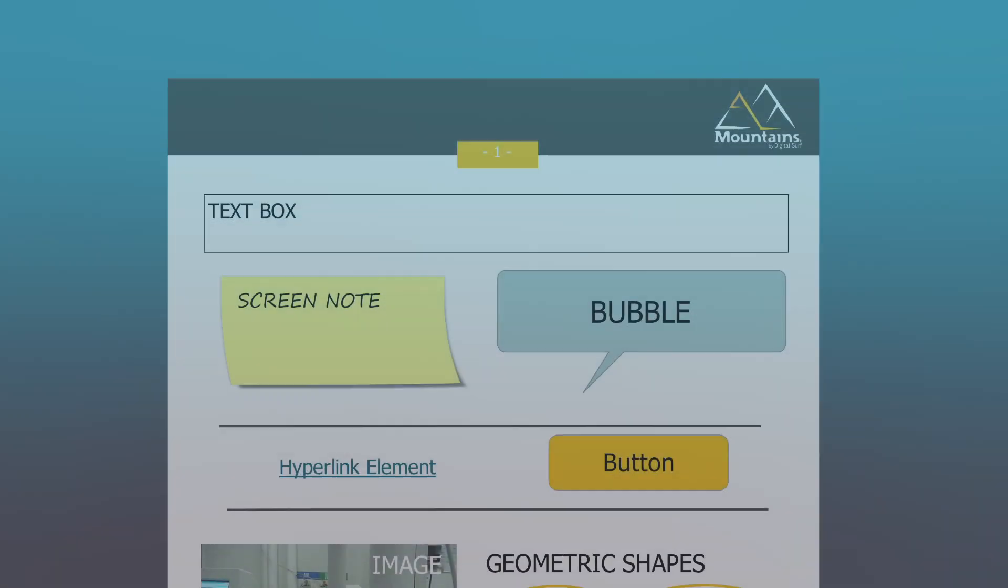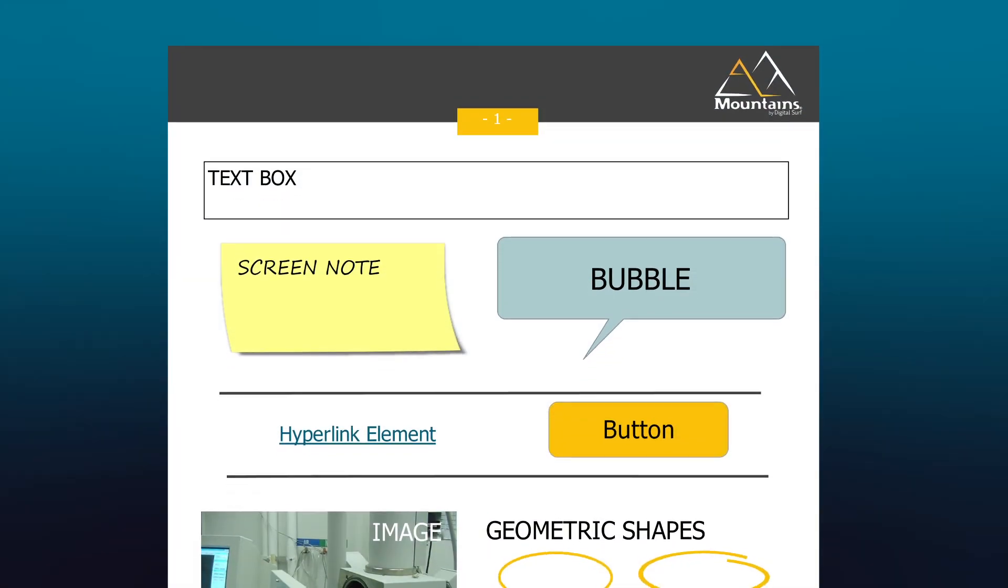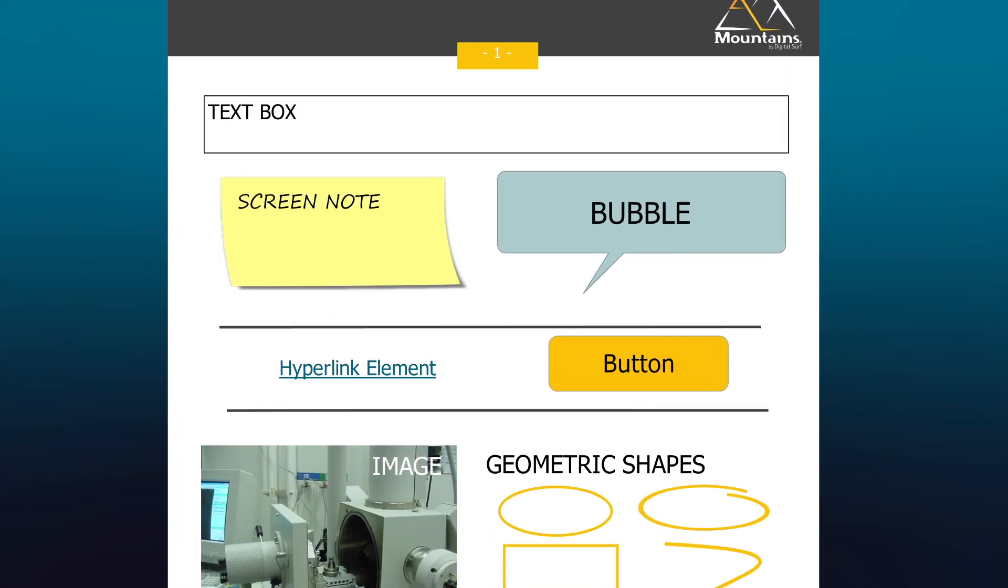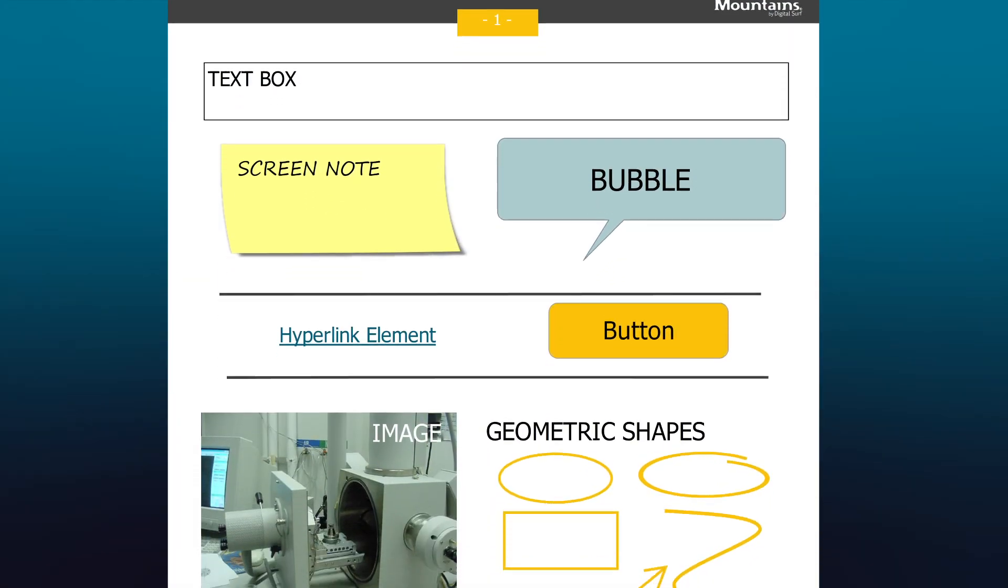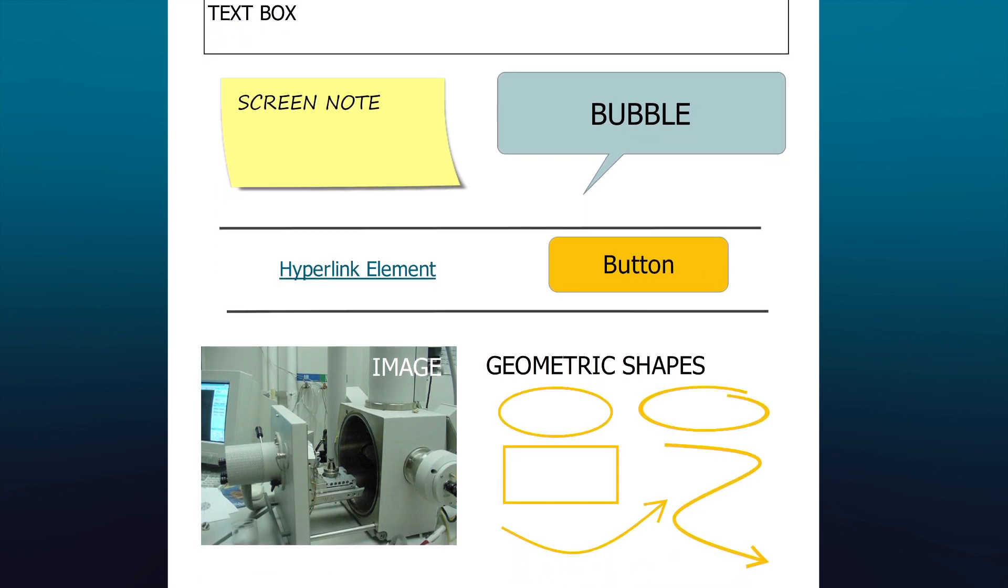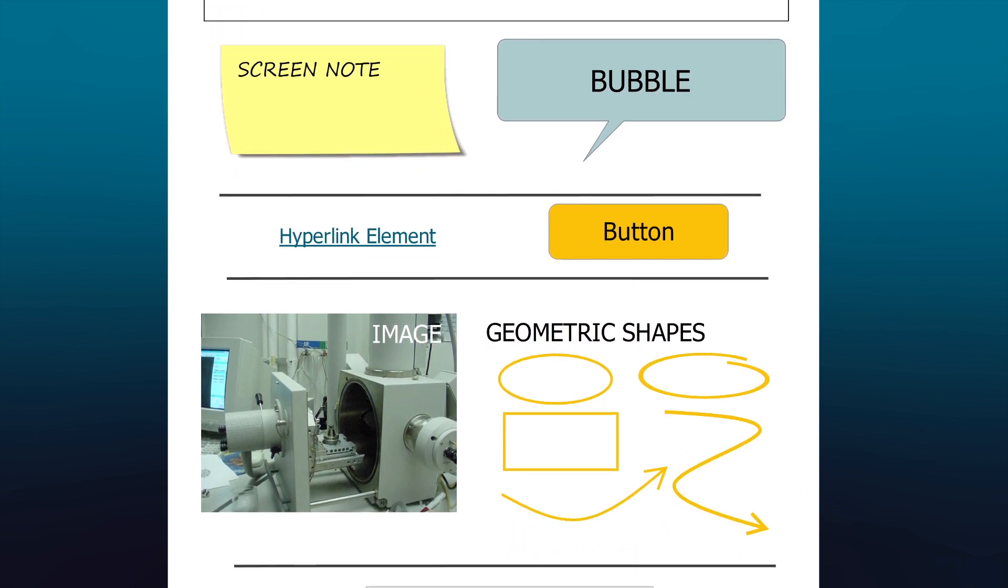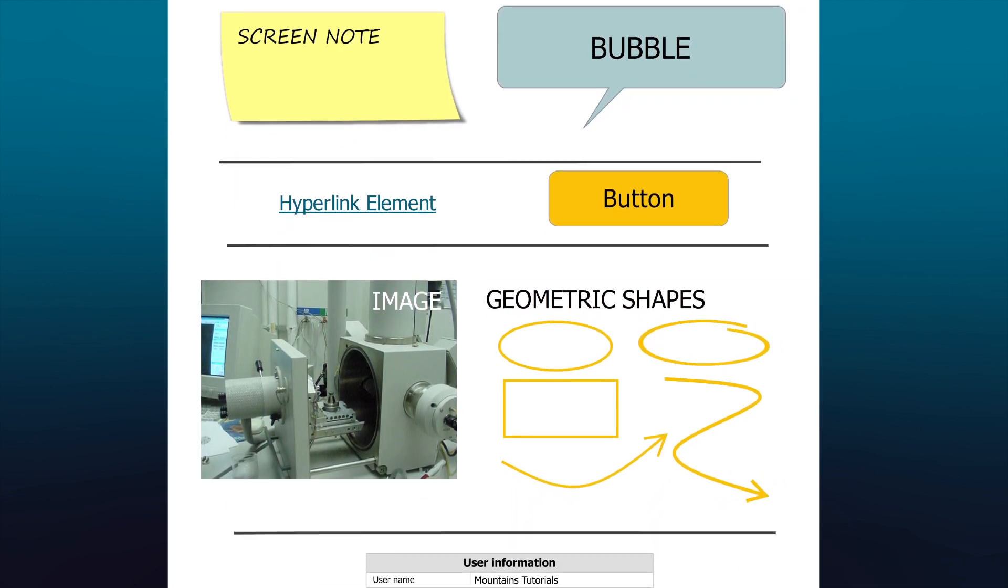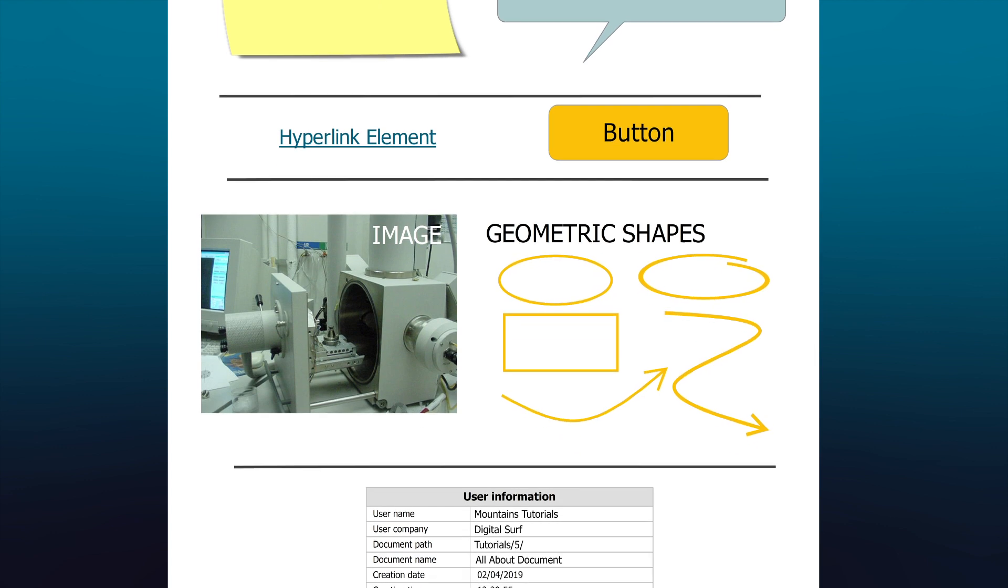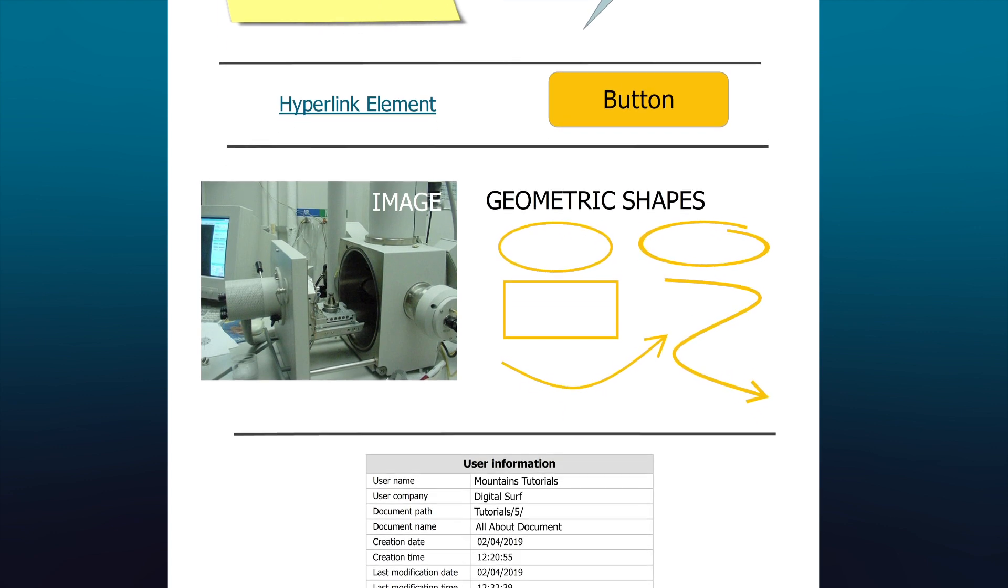Many other elements are available for insertion into the document, such as different types of text boxes, hyperlinks and buttons, images and geometric shapes, date and user information.